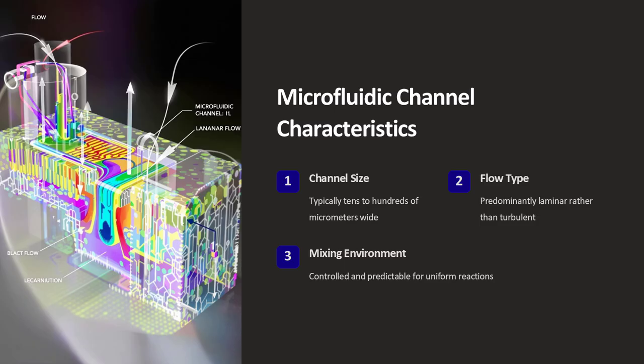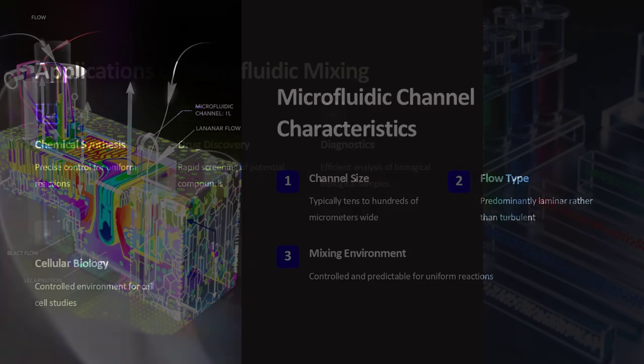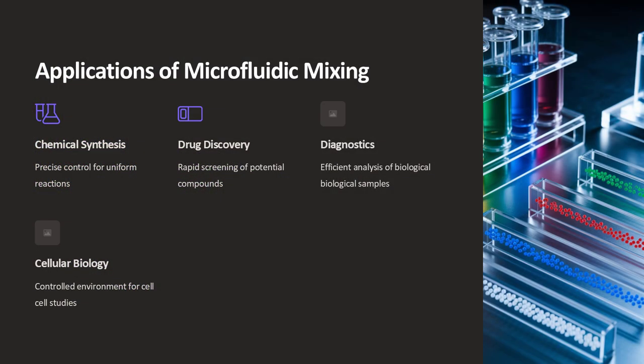This controlled, predictable environment is essential for achieving uniform mixing and controlled reaction kinetics, which are critical for applications ranging from chemical synthesis and drug discovery to diagnostics and cellular biology.